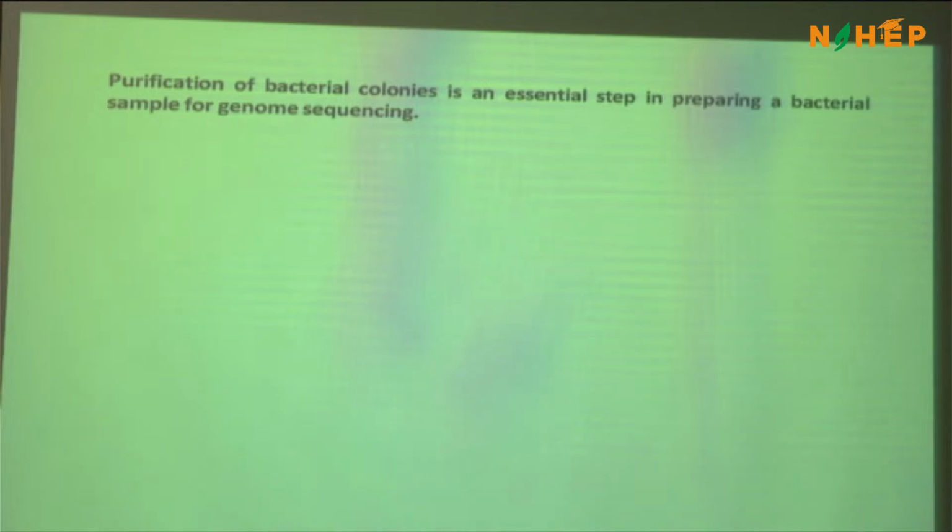Okay, so this morphotyping with assistance from a dye, I would call redox dye-assisted morphotyping. This is one of the very elegant techniques that would help you to do the microbiological purity of your sample, right? Now you are entering into another stage. Okay, I have isolated the same species, but are they the same? If too many colonies are looking alike in the plate, whether all of them are the same species with the same functional potential, or they have some finer differences.